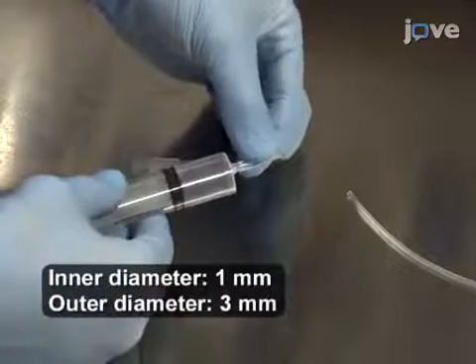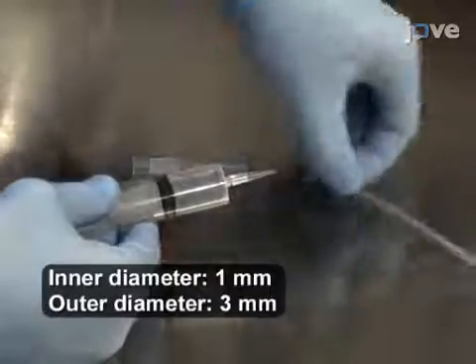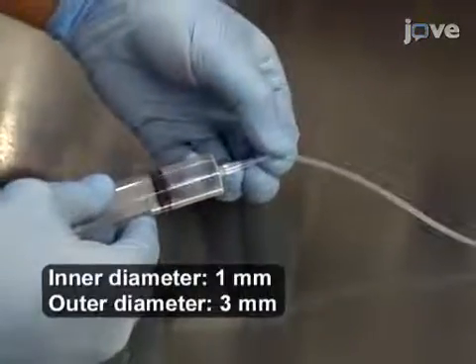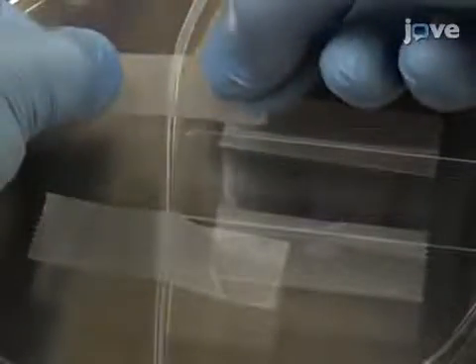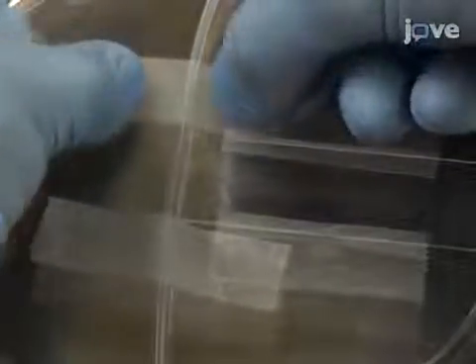To begin this procedure, connect a 20-milliliter disposable syringe to a silicon tubing. Next, tape a standard microscope slide to a large inverted petri dish. Then, tape the silicon tubing immediately adjacent to the microscope slide.